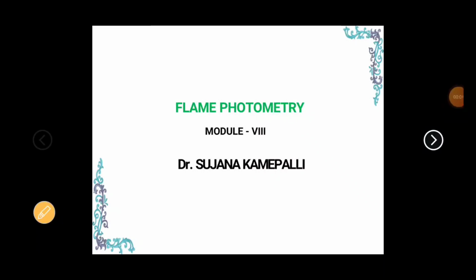Good day, Flame Photometry Module 8. Today we are going to learn about the principle and instrumentation of flame photometry.